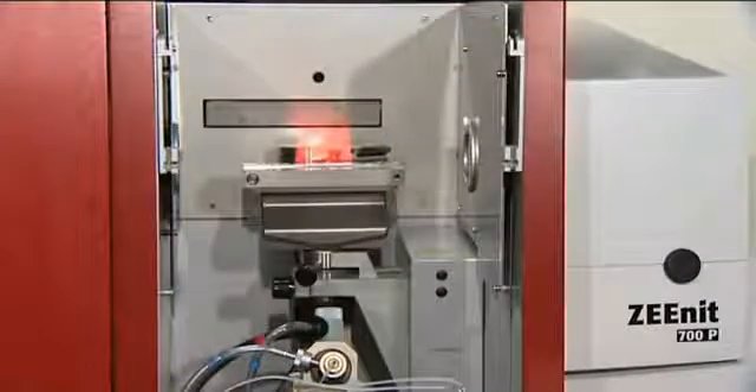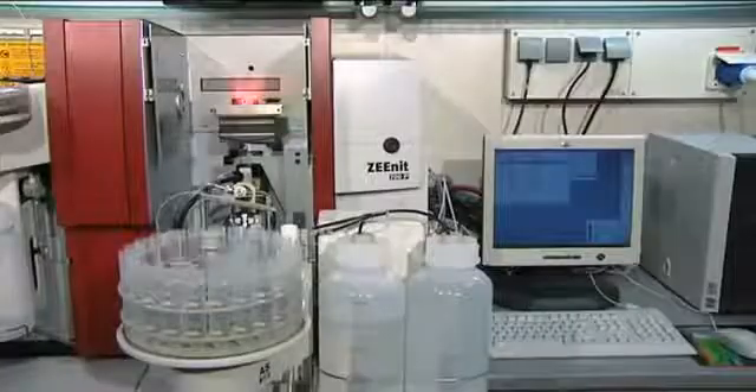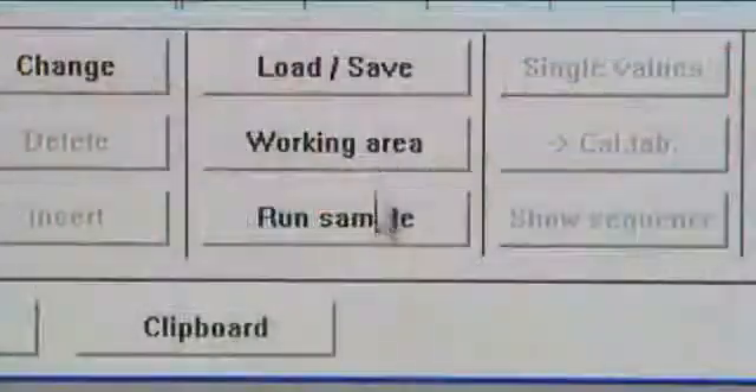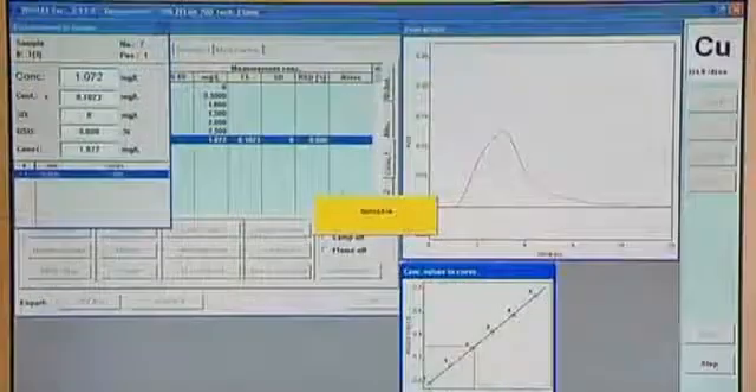By using an injection switch, this system is flushed continuously between sample measurements. This prevents entrainment effects and ensures uniform flame conditions. Smaller sample volumes of a few milliliters can be processed with the help of the injection technique.